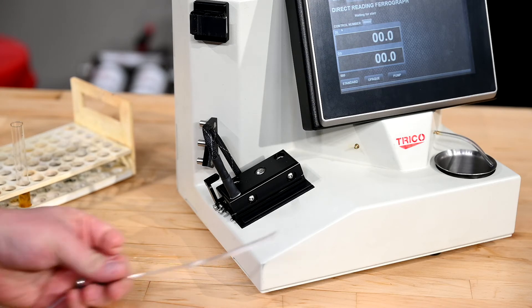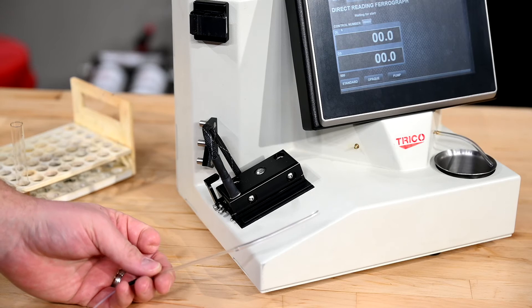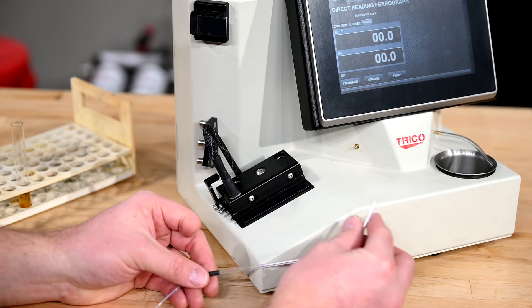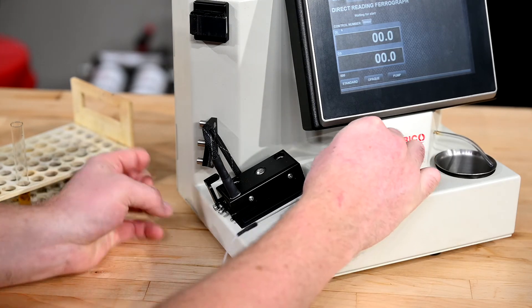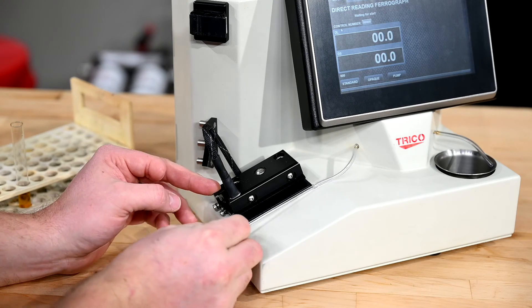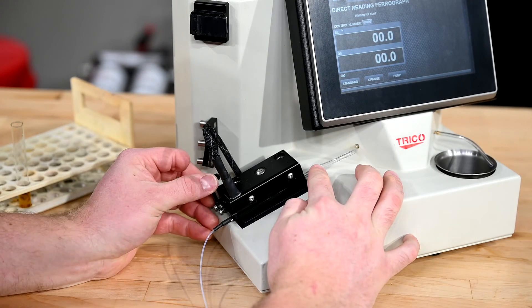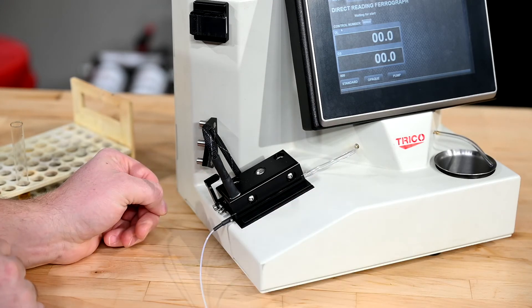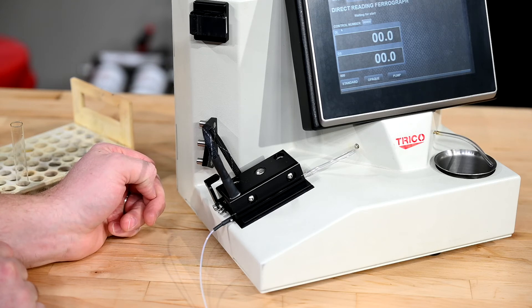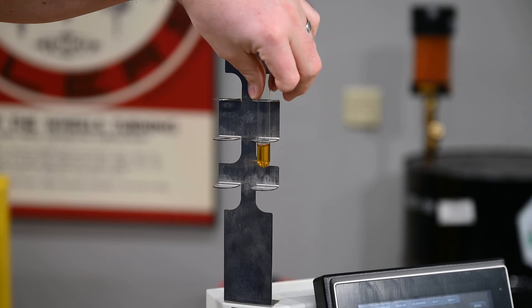The first step is to attach the precipitator tube to the left bulkhead and underneath the delivery arm above the magnet assembly. The precipitator tube will get connected to the left bulkhead. Then you will lift the delivery arm, get the tube underneath it, and close it to make sure the delivery arm is closed and the precipitator tube is above the magnet assembly. Now we take our sample vial and place it into the vial holder.